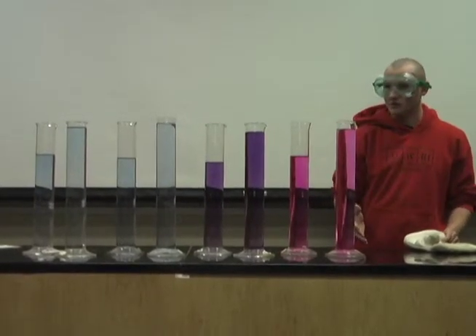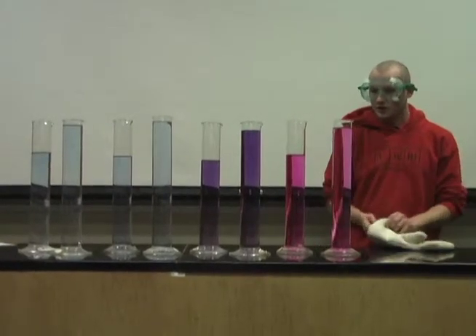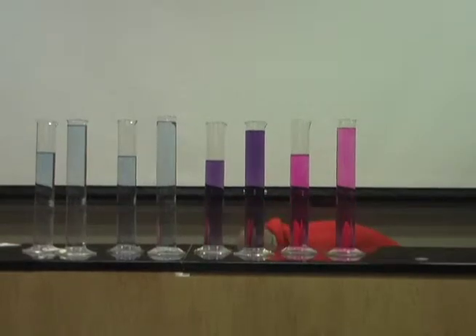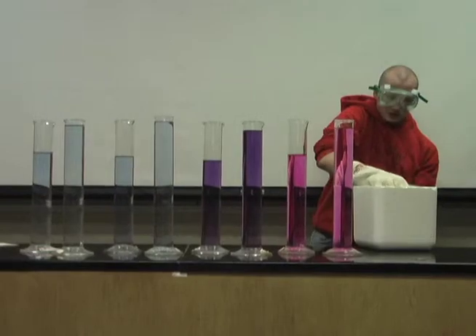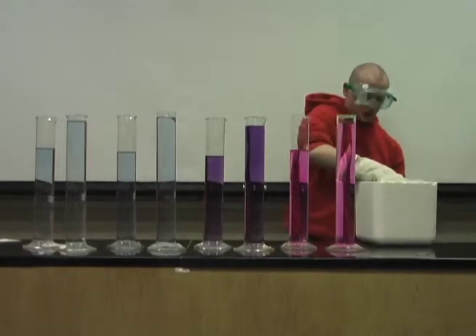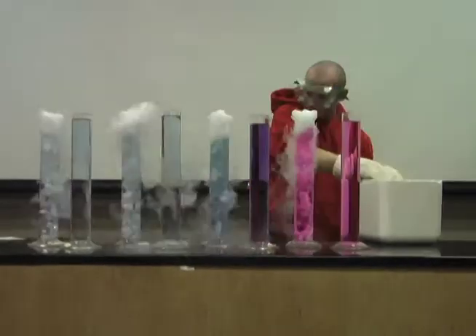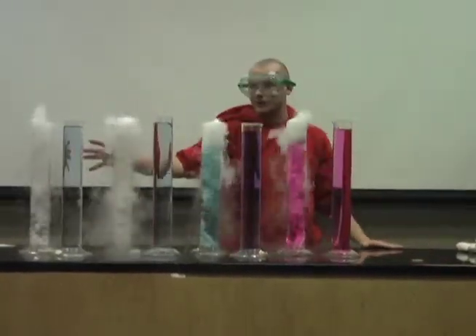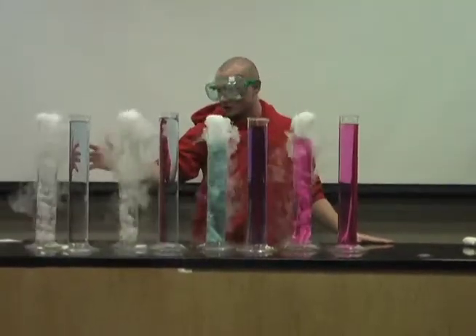Some indicators have a narrow range that they change over, and some have a much larger range that they change over. So what we'd like to do is add some dry ice, which is acidic, and we'll see how that changes the pH. And we can see here that these have already changed, showing that they have already passed their point where they go through a color change.